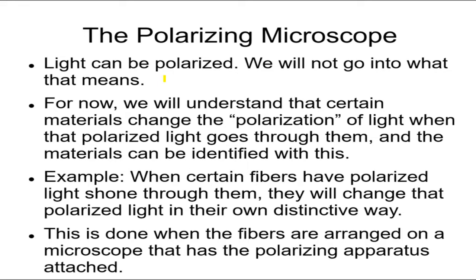But then again, the fact that two carpet fibers are the same color doesn't mean they came from the same room. However, if you not only see the color, but you also see the way that it changes the polarization of the light, you can send the polarized light through the fiber and see how it rotates this polarized light. You can tell, and they both rotate the same exact degree. Let's say they're both 5 degrees. They both rotate this polarized light 5 degrees.